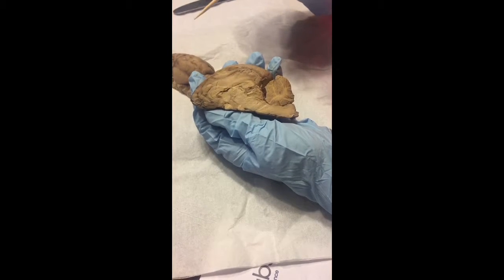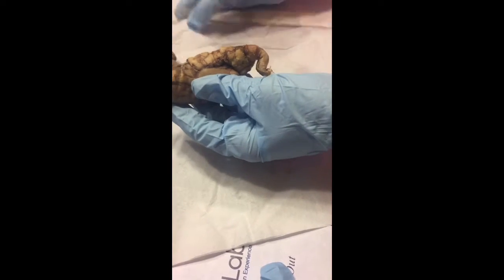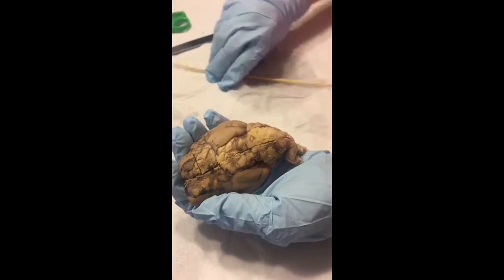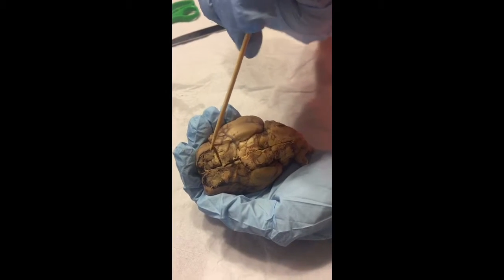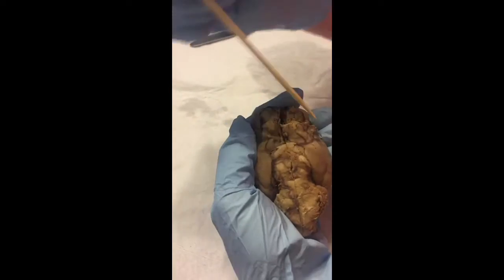Next, we have the olfactory bulb. We put this back together and look at it this way. The olfactory bulbs are these right here. The optic chiasm would be this part right here.